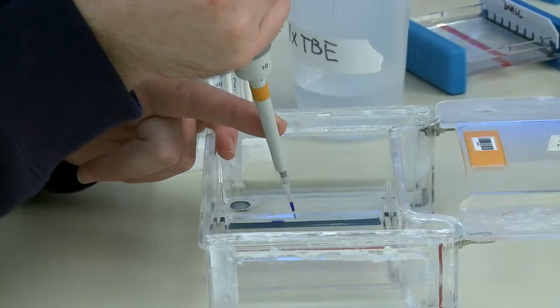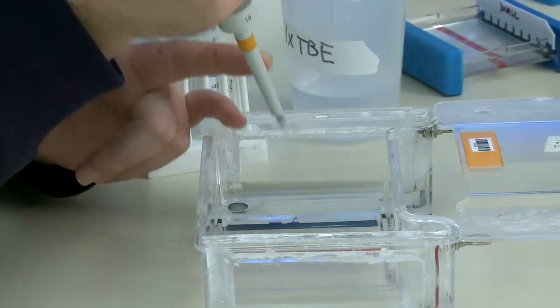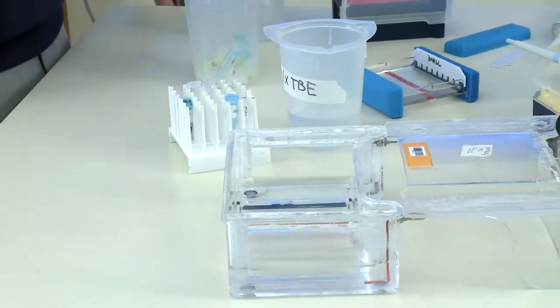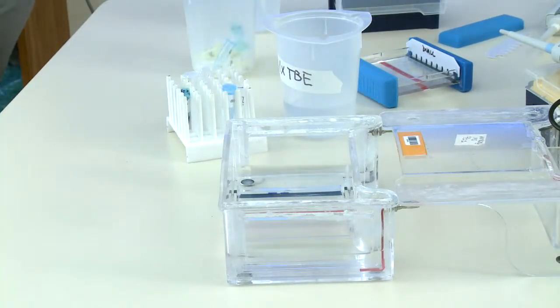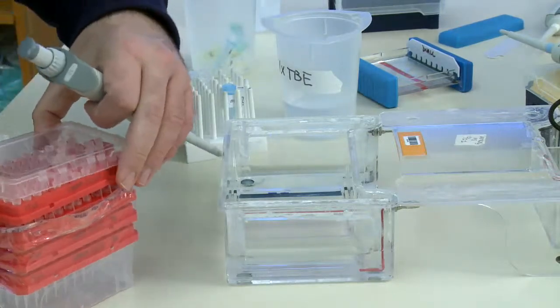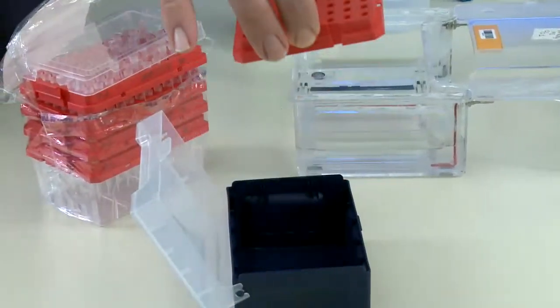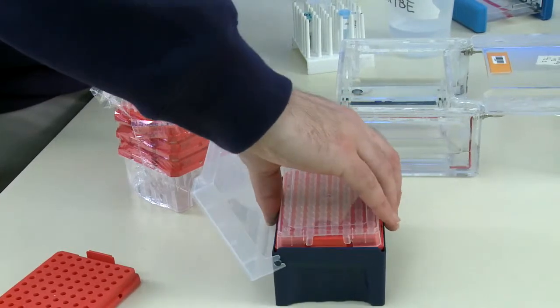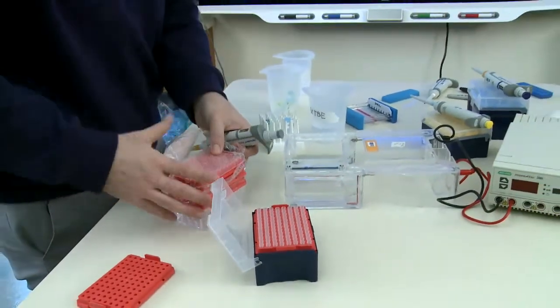Okay, so I go to my H tube, my H lane, and I go ahead and dispense my H into that lane. Then I go ahead to my next tube. Hang on, let me just get a fresh thing of tips here, guys. Give me 1 second. So these tips are pretty nifty. We have this interchangeable box here. I can pull out the old tray, and then I can replace it with a new tray right here. And it has a little sterile lid just to keep everything sterile.